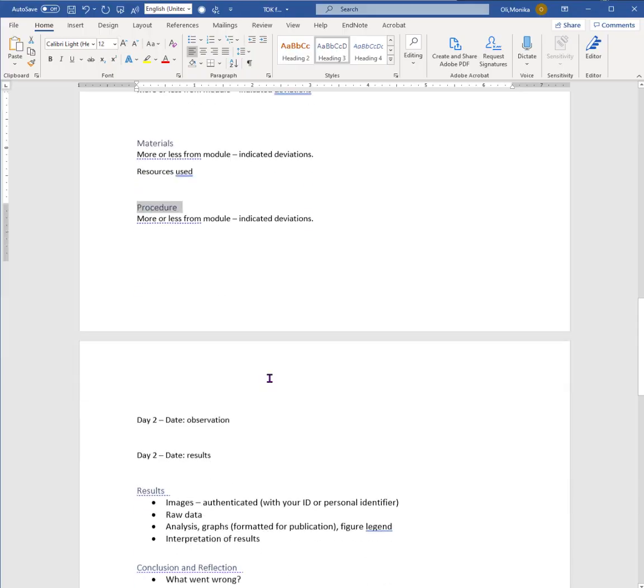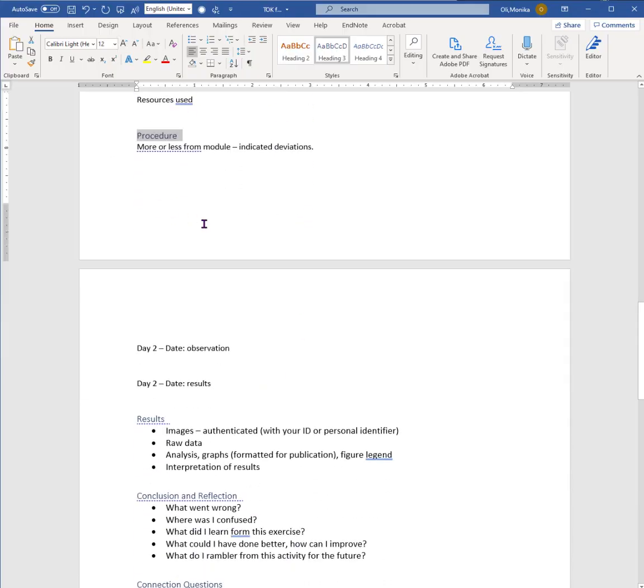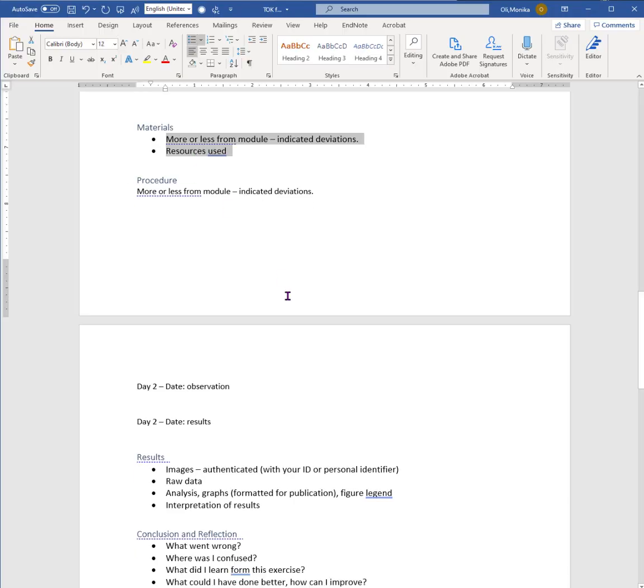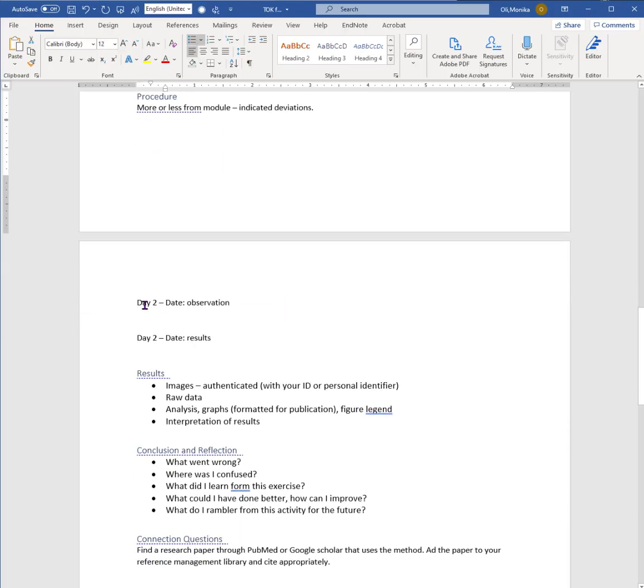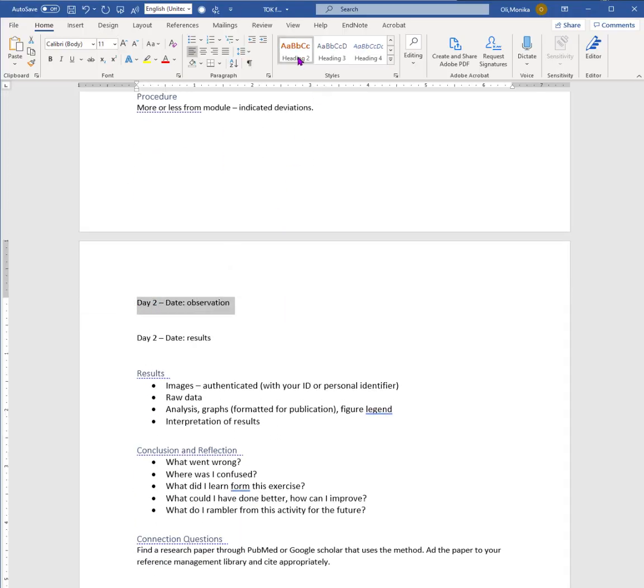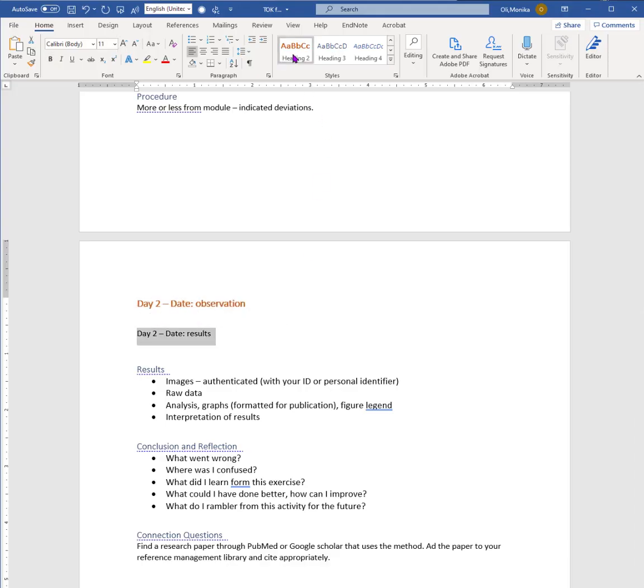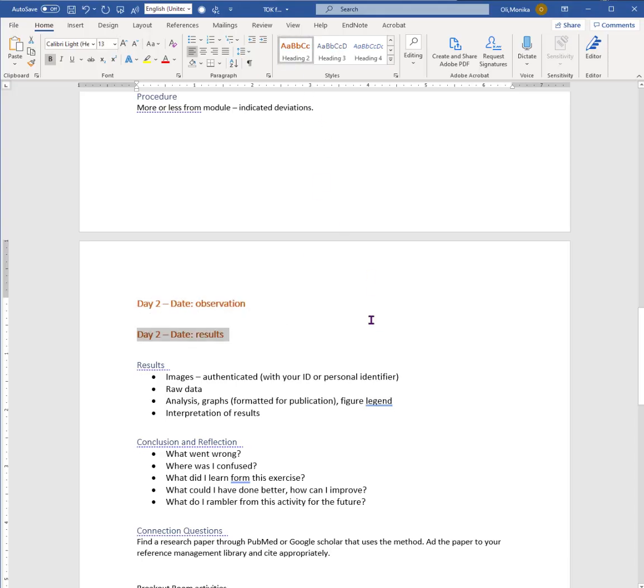Resources used - I think that's important. This one with bullets makes it look a little bit better. And day two would be heading two again, just an observation, pictures, and it obviously varies with each experiment.